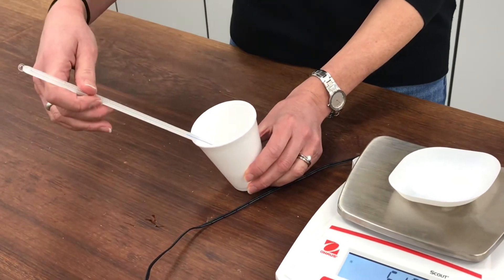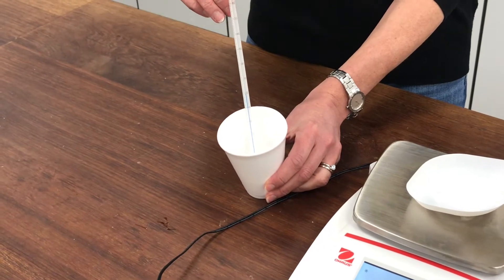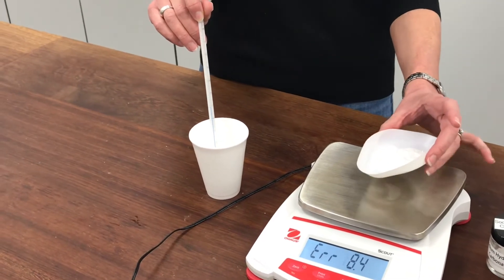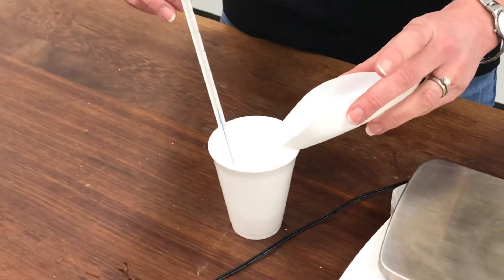The temperature is about 19 and a half degrees. I'm going to add my sodium hydrogen carbonate to it, and I'm expecting it will fizz up and the temperature should change. So we'll have a look and see what happens.